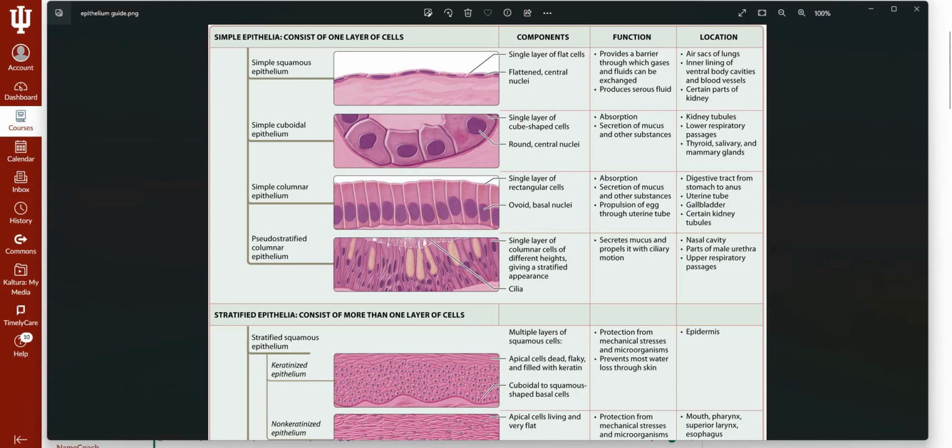All right, so how do we identify different types of epithelium? Well, epithelium is largely a cellular tissue, so we're going to be dealing mostly with cells. The other component is called extracellular matrix or ground substance, sometimes abbreviated as ECM. Really all that is, is water and a lot of large molecules like proteins and carbohydrates, things that are going to enter cells and help nourish the cellular material. But we're mostly focused on cells right now, so we're not going to worry too much about that matrix.